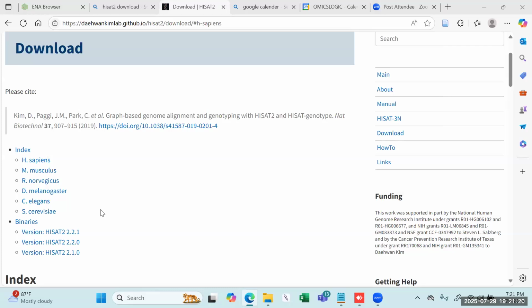What this alignment tool does is search the indexed file and move towards the regions where the reads belong in the genome, in a very quick and efficient manner. So there is going to be an index for the tool. Instead of going through each base pair, it is going to go to the exact position where the indexing coordinates are present, right?